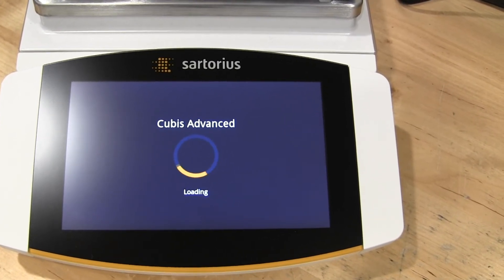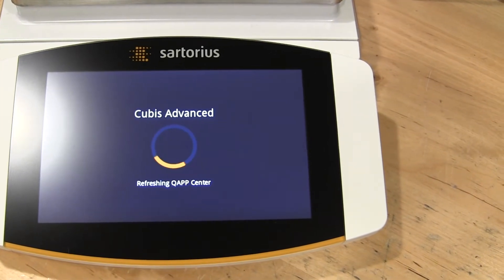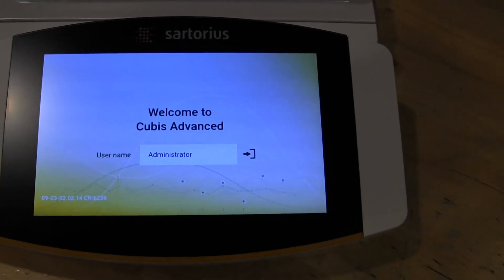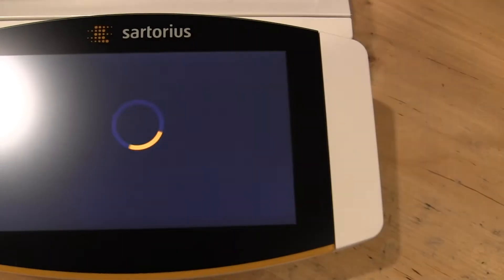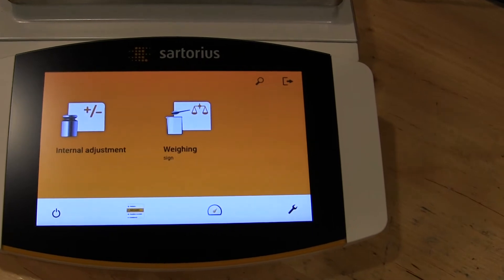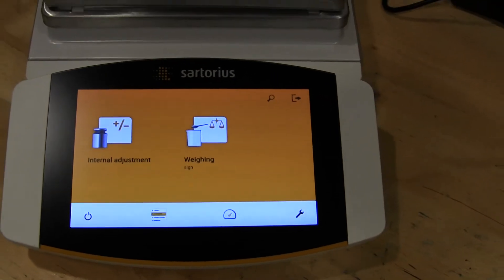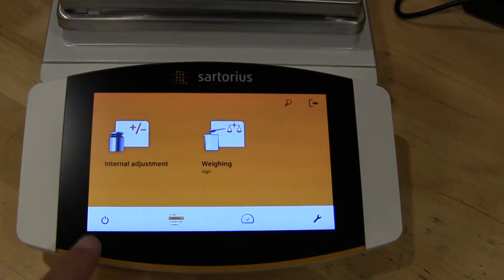You can see the balance is loading its profiles and refreshing its QApps. This particular model has all of the QApps loaded. You'll see users, administrator, and when the balance loads we can do an internal calibration. This particular model — in fact they all — have motorized internal calibration.